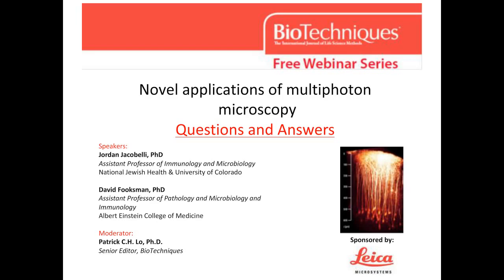Another question then is, can two-photon microscopy be used to monitor calcium flux in neuronal cells, for example, after the cells have been exposed to a certain treatment?